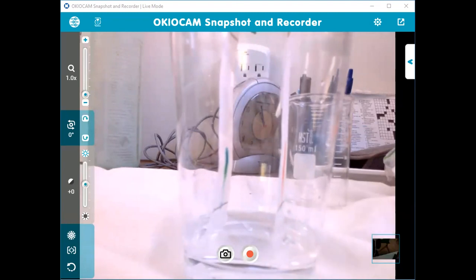The water will continue to travel even after you've taken the paper out of the water. So what's going to be important is to let the water travel a little bit more, until it starts to dry off. And you want to mark where the water traveled to. So the actual finish line, let me show you this on here.